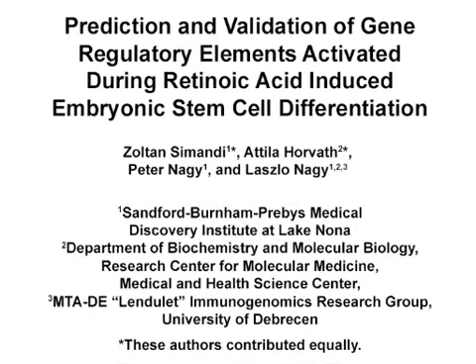The overall goal of this video is to provide an integrated set of methods to identify and experimentally validate genomic regulatory elements, so-called enhancers.